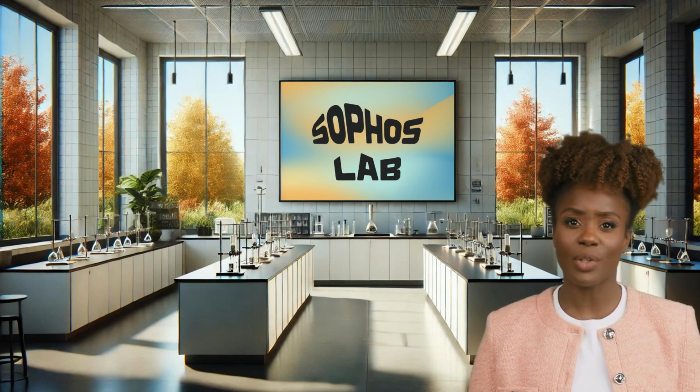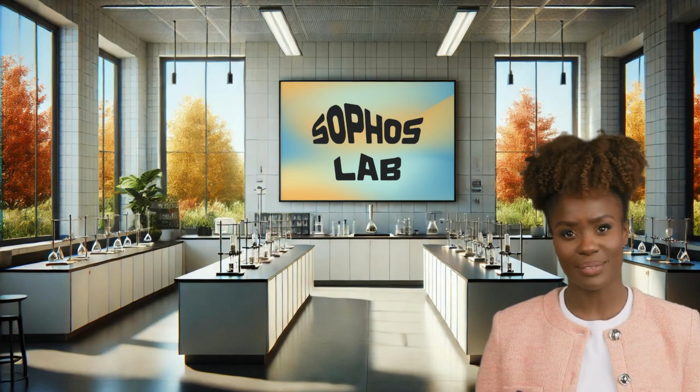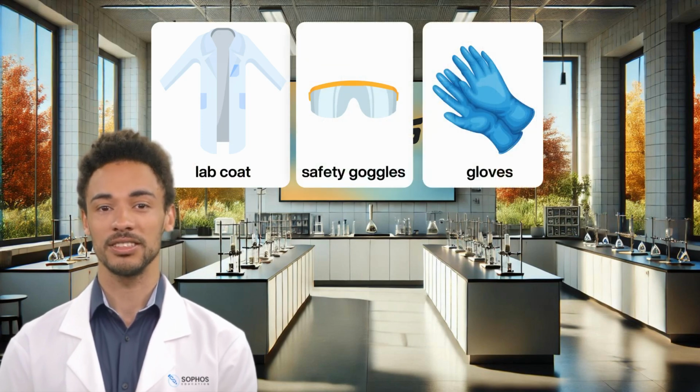Before we begin, over to Sam, our lab technician, to outline what safety equipment we need. Hi everyone, I'm Sam. Before we get started, make sure to put on your lab coat, safety goggles and gloves. Safety first in all our chemical explorations.